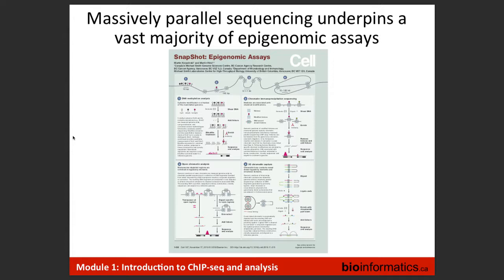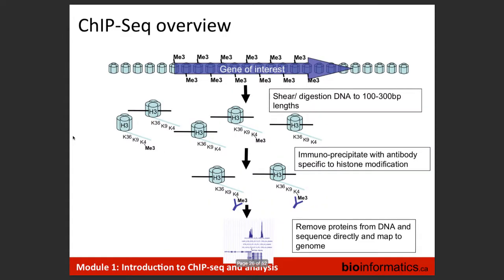And more recently, three-dimensional strategies. Of course, we know that the genome is not a linear molecule in the nucleus, but it's actually compacted and packaged in a very tightly regulated way. And this three-dimensional structure itself can be informative in many different ways, although I don't think we're going to get into that in the next couple of days. But that's another modality that can be looked at using NGS platforms.